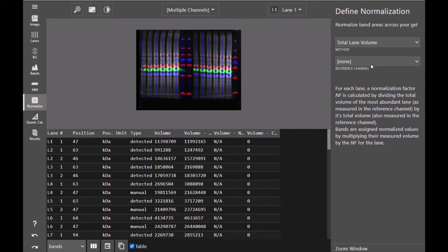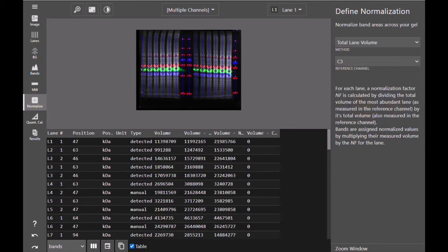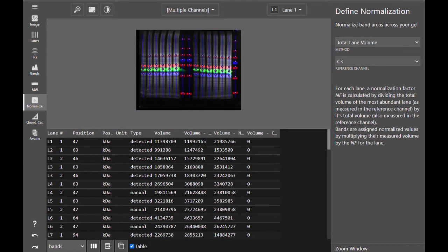To normalize using total protein signal, you select your reference channel, in this case channel 3. The software will determine the most abundant total protein lane and set that as the reference lane. The total protein signal in all other lanes is then compared to that reference lane in order to create a normalization factor for each lane.